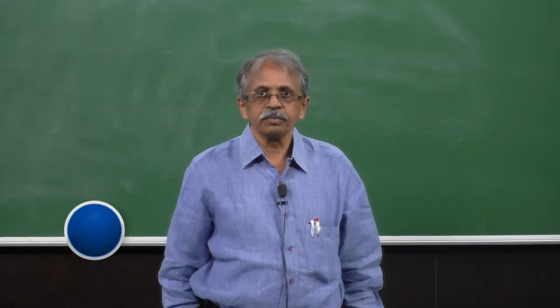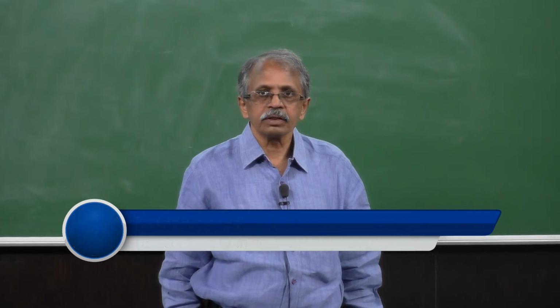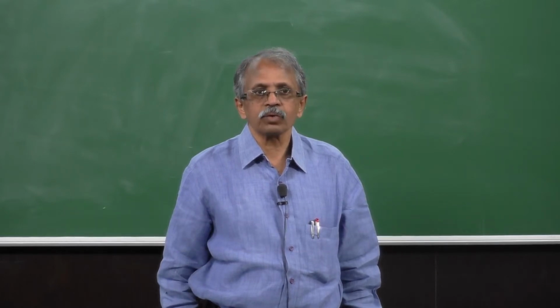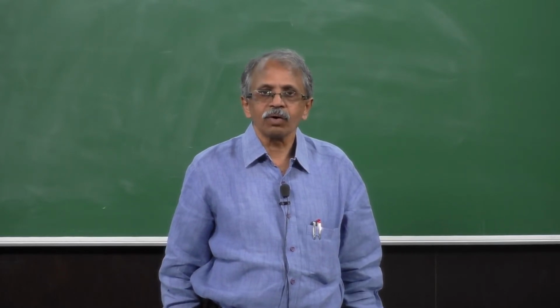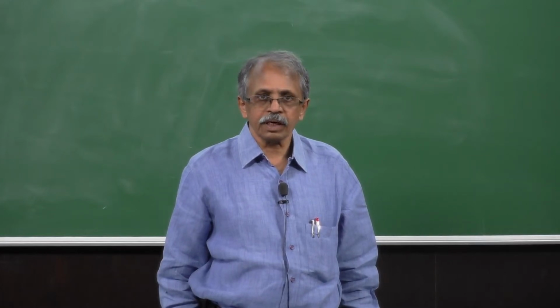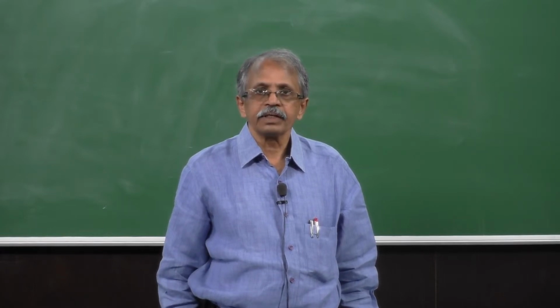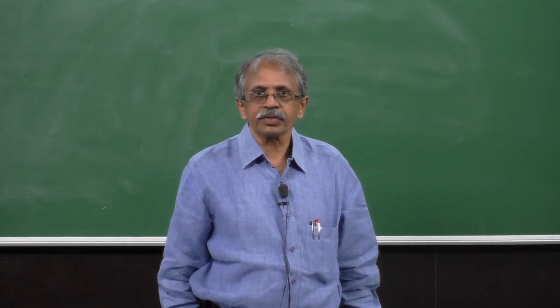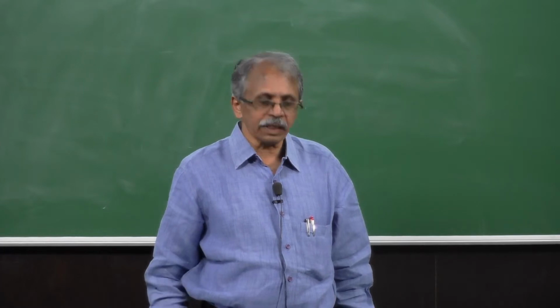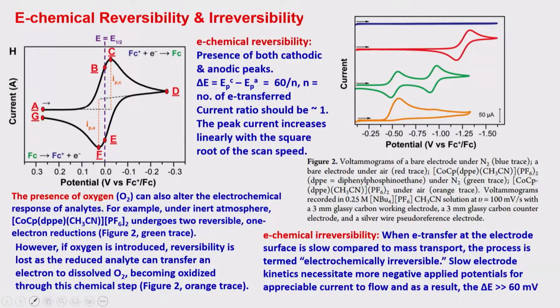Good morning, welcome you all for the next lecture in this particular course on analytical, spectral and microscopy applications of inorganic compounds and nanomaterials. We have been seeing in the previous class on the electroanalytical methods, and we were discussing the aspects related to cyclic voltammetry, and let us continue with that. We were talking about the reversibility and irreversibility.